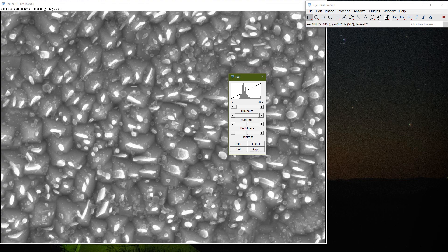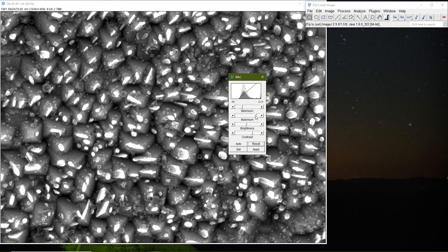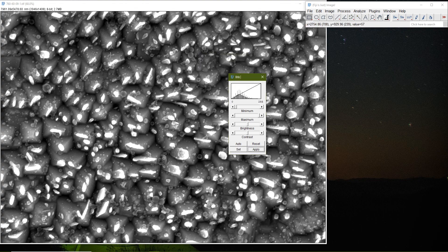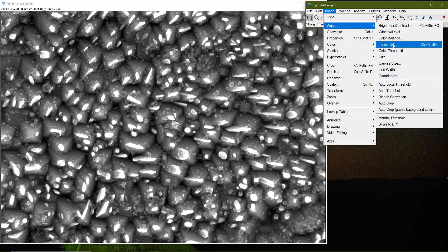If I reset it again you'll see our initial image, and then if I adjust it a little the particles are a bit more clear. I press Apply and it says the pixels will be permanently changed and we cannot go back — I say OK, then close this dialog.